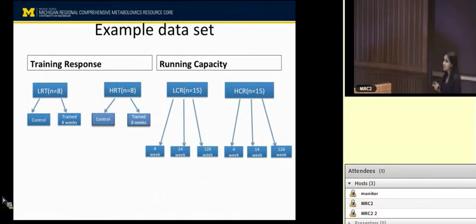And this is the data. Chuck already discussed this in detail, and I already showed the data report that we generate. But I'm just going to show you how, with the same data set, we do things in MetaboAnalyst, just to give you an overview.